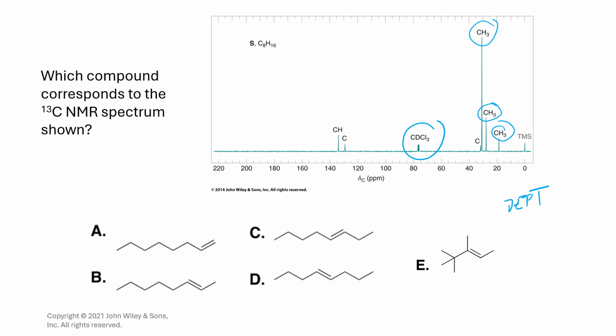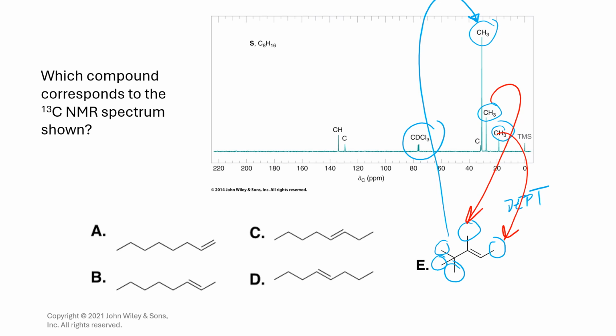This molecule, I'm going to say it quickly, is the one that matches because this 3 is 1 and this is this large one. Large integration. The other 2 methyls are these 2. So one is this and one is the other. And here you have carbon, carbon, and carbon. The carbon here is quaternary, meaning it's one of these C's.